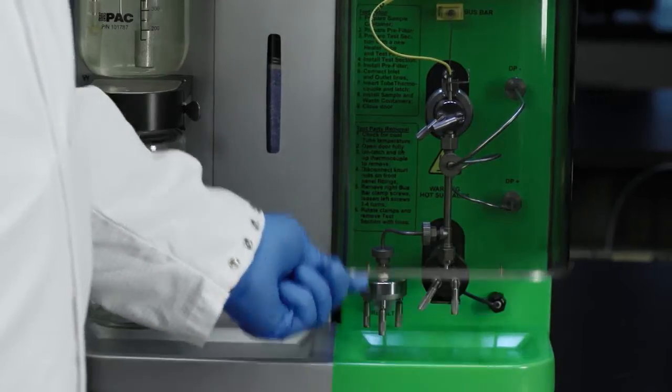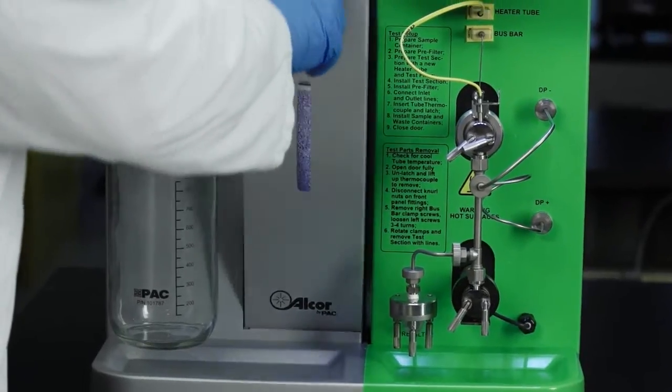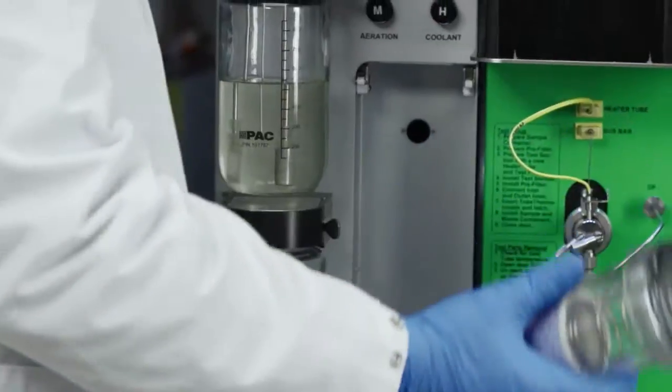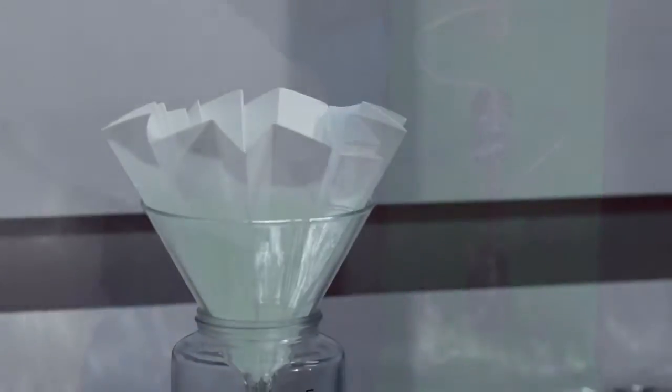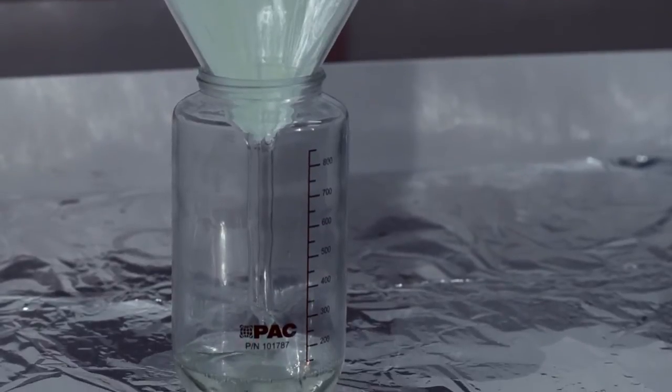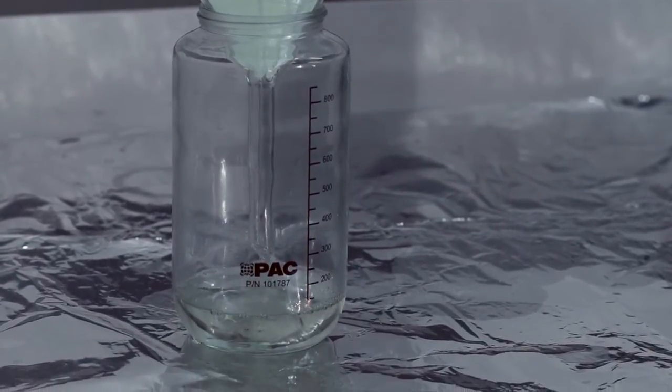If you're familiar with previous generation Jephthahs, you'll recognize plenty of similarities, and what isn't similar is designed to be intuitive and easy to understand. To get started, you'll filter the jet fuel directly into the sample container. This process hasn't changed from the Jephthah 3. Make sure you perform this step in a laboratory hood.